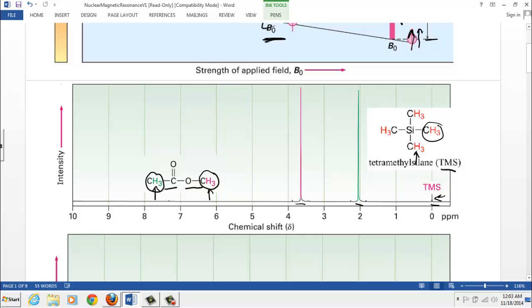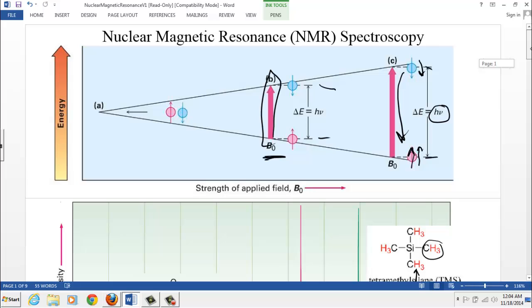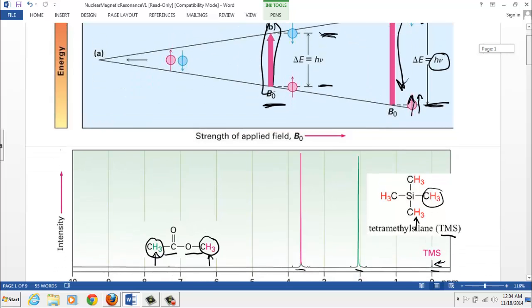Okay, what's happening here is that in addition to the changing magnetic field of your magnet in the NMR, that can change the energy levels, right? So you use a stronger magnet, makes the energy gap bigger, changes the frequency. So that's one phenomenon.